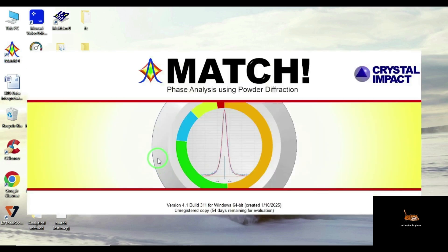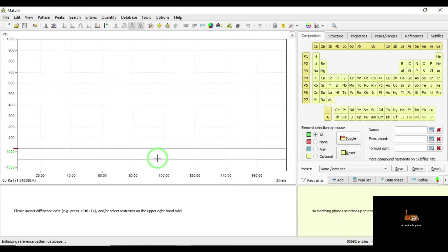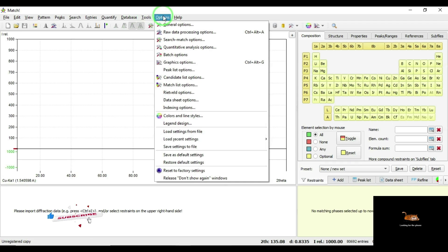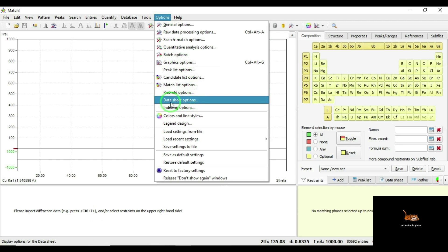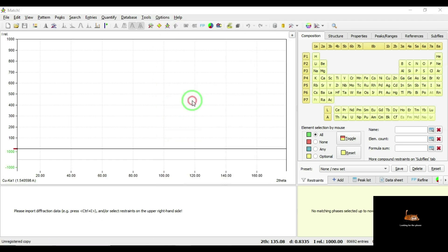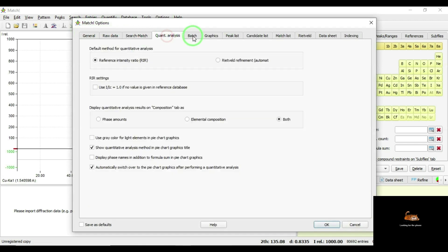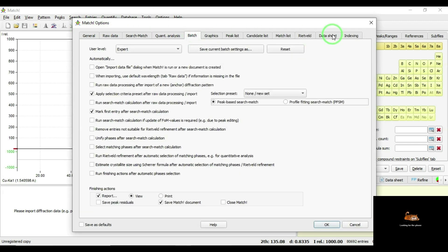Continue. This is the main view of the Match phase identification package software. Before going to the main process, I am going to Options and selecting the Data Sheet option. Here you can see a number of options for representing the standard data. Here I am selecting Data Sheet.